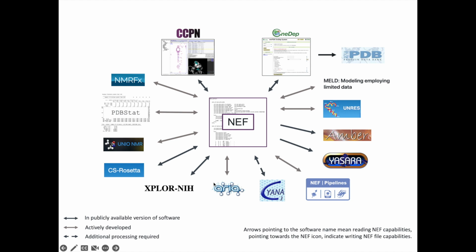In addition, Aria, now in its development version, is reading and writing NEF, and we'll show that to you today. Cyana has a slightly older specification of NEF implemented, so it does sort of work, but there are a few things that you sometimes need to change manually. And we'll also be showing you today NEF pipelines. Again, this is a program that's still in development, but we'll be making it available to you, and again that can read and write and do lots of things with NEF files.